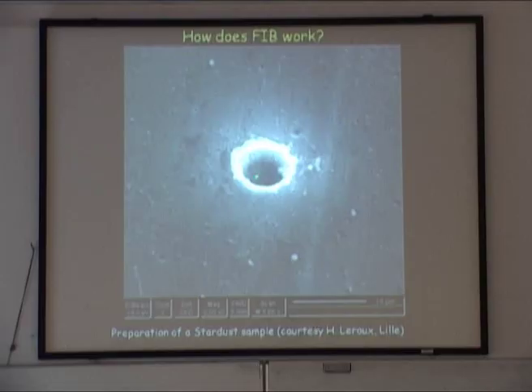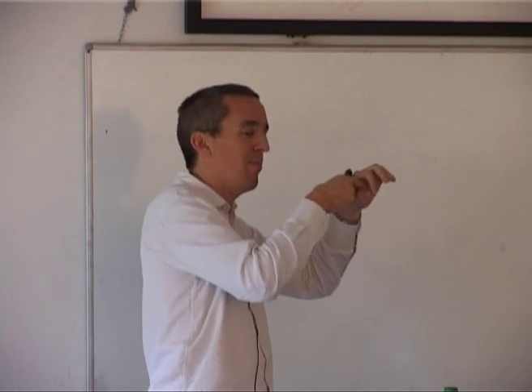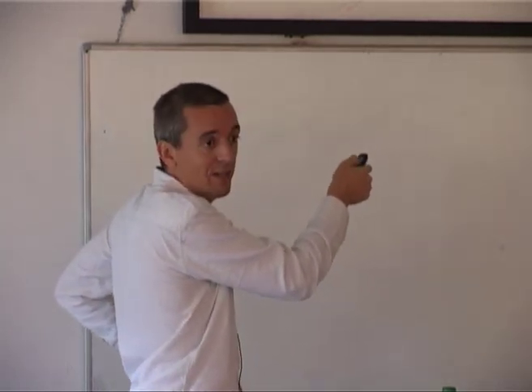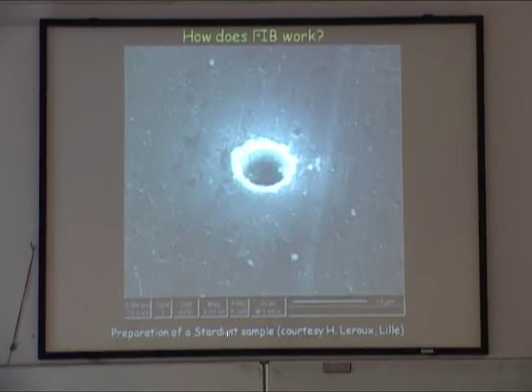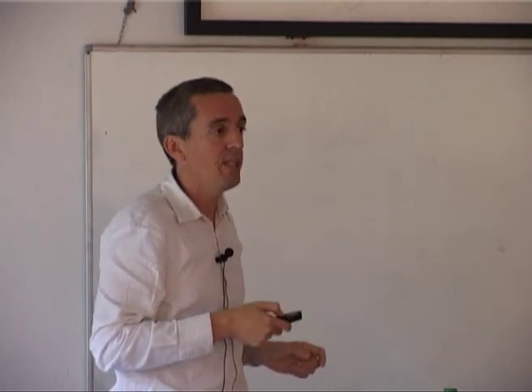the dust, I mean the fragments of the comet dust, were collected on the gel. So the dust impacted the gel, and this is the impact crater of the fragments. And so what they want to do here is there is a fragment, a mineral fragment within the crater. They want to cut a cross section across this. So take the cross section and put it in a TEM.